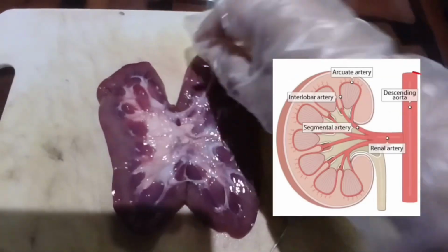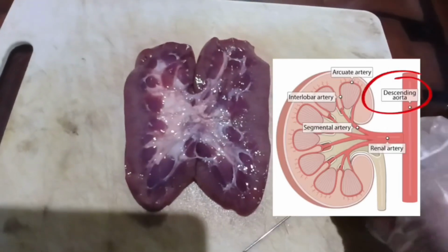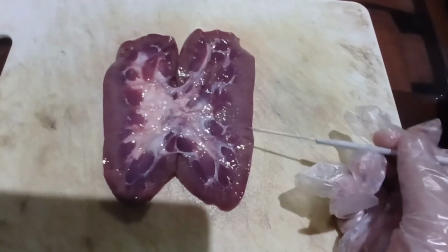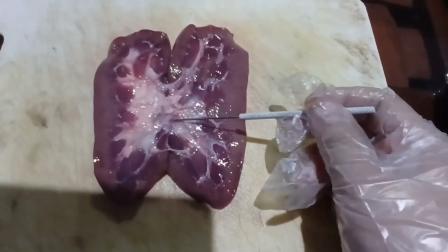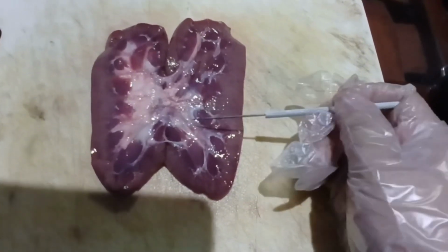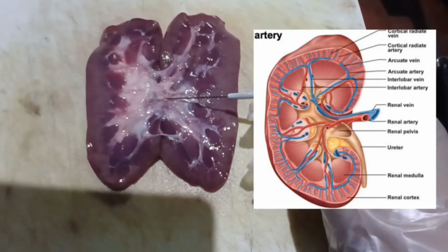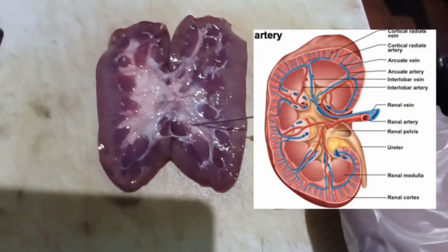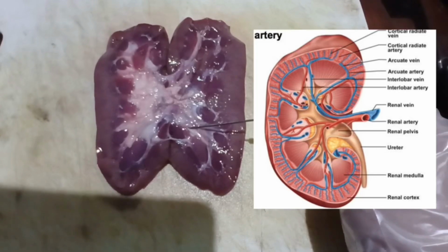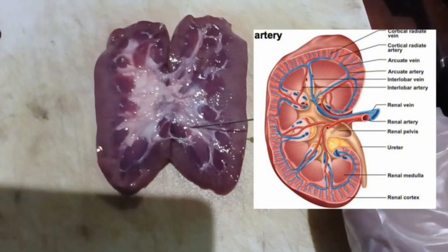Since the aorta is the largest artery in our body, it carries the oxygenated blood away from the heart to the rest of our body. Then we have the renal artery, the second part of our pathway of the renal blood vessels. It branches off the aorta and supplies blood to the kidneys specifically. This blood is already oxygenated and rich in nutrients, but also has waste products.